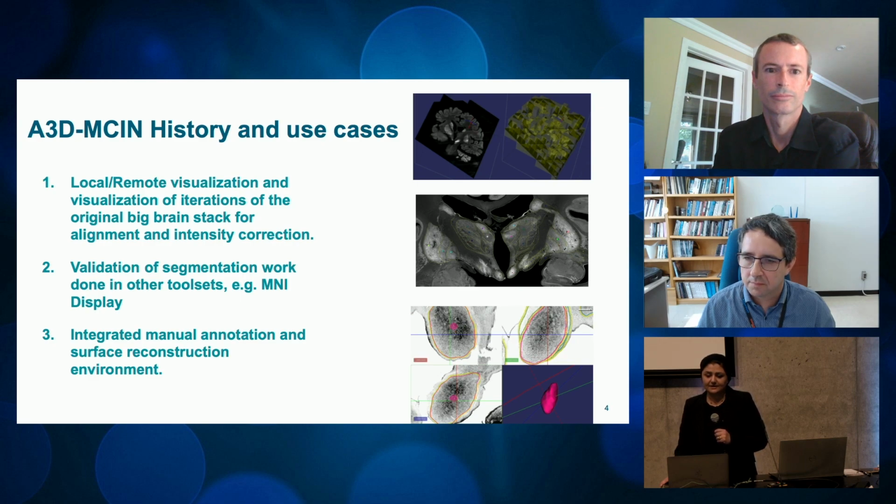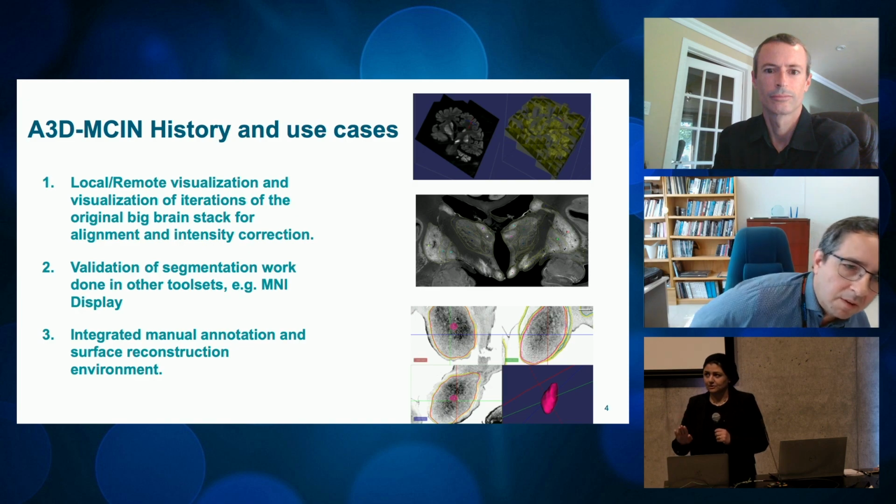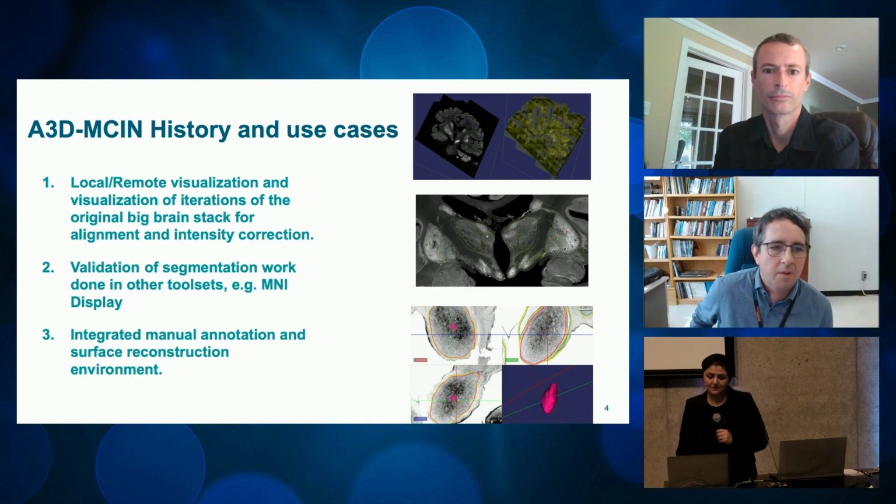After that, when the scientists started to work on manual segmentation of different structures of the brain, this software got upgraded to make it possible to validate the work done in other tool sets, for example, MNI Display, where the analysts sketch the boundary of 2D sections and then put them together as a stack in BigBrain.